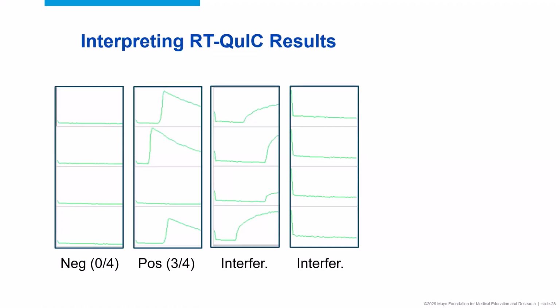We didn't call it positive. We got clinical information, and indeed the patient did not have prion disease, but unfortunately, we were never able to identify what triggered this kind of atypical reaction. So when we interpret these results, not only are we looking at was there reactivity, but we're also looking at the shapes of the curve, ensuring that they're consistent, et cetera.